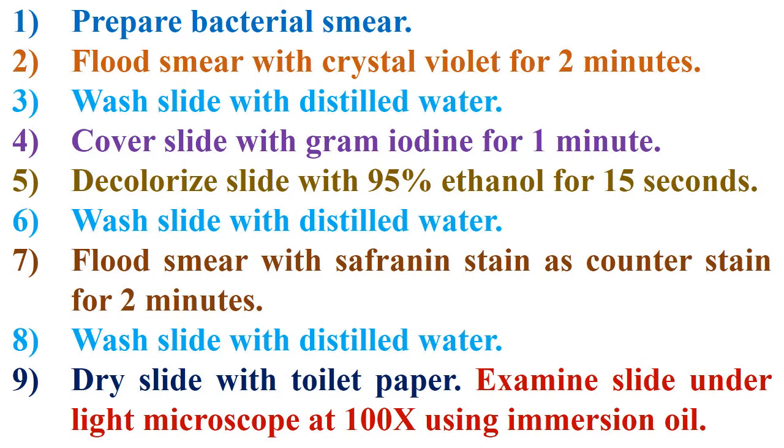Step 4: Cover slide with gram iodine for 1 minute. Step 5: Decolorize slide with 95% ethanol for 15 seconds. Step 6: Wash slide again with distilled water.